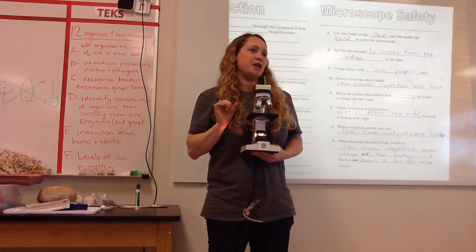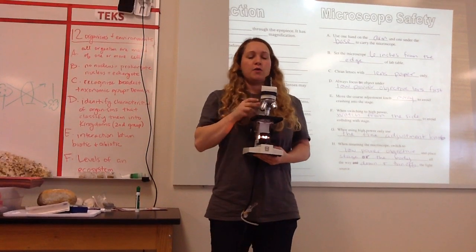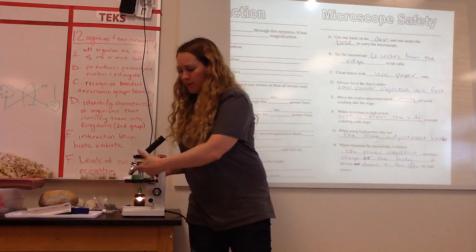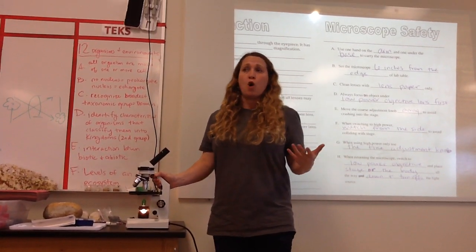It's in. Did you hear it? It's easy to feel, too. If you don't pay attention, though, it's easy to pass it as well. So now I should be closer. But I changed the distance between the eyepiece and the objective, so it's not going to be in focus anymore. It should still be there, but it won't be clear.